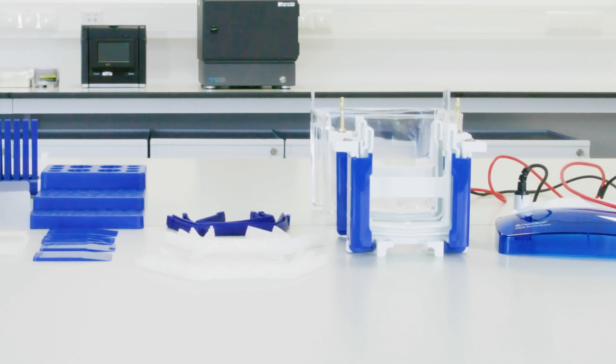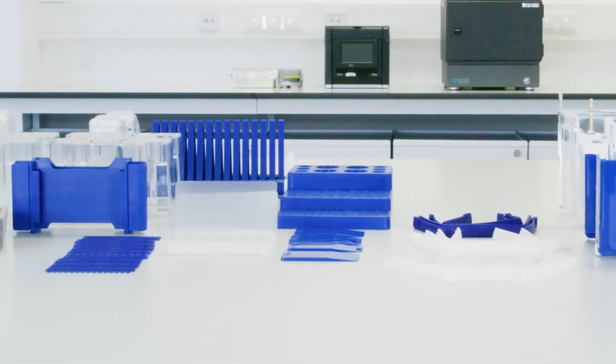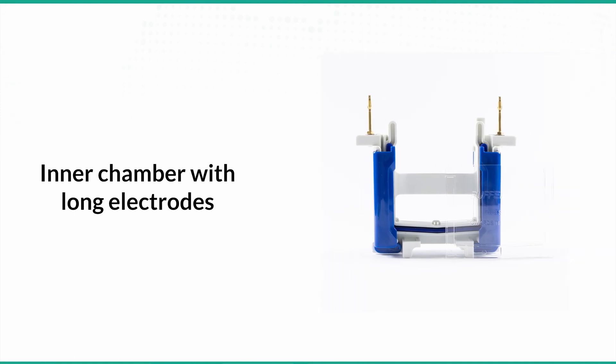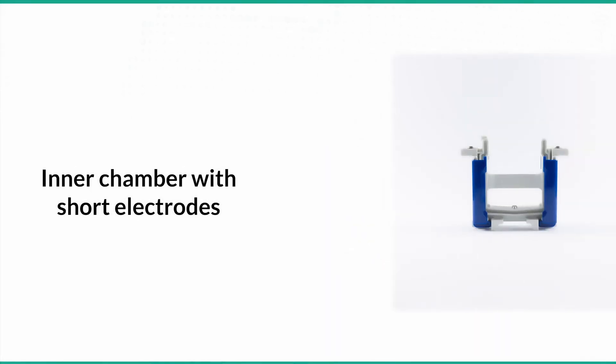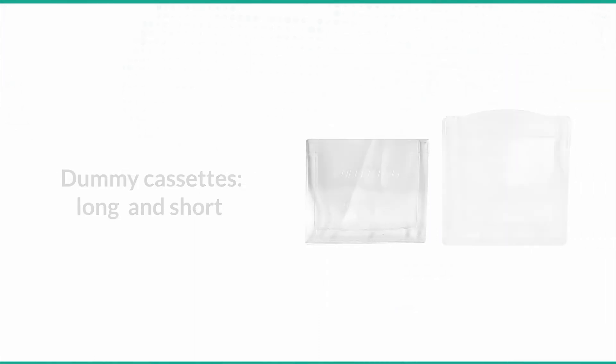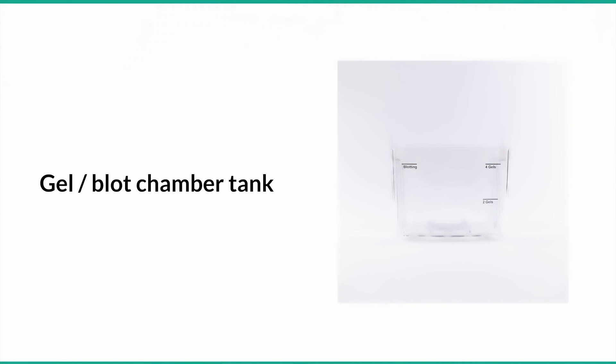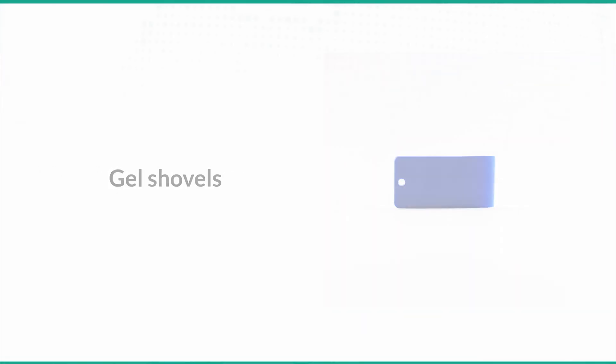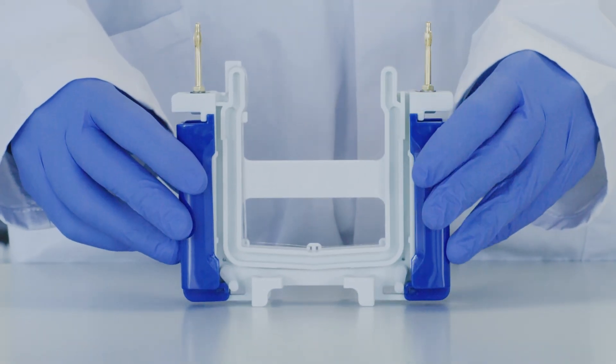Unpackage all components for GIL electrophoresis from the boxes and plastic bags. This includes an inner chamber with long electrodes, an inner chamber with short electrodes, three kinds of sealing strips, a dummy cassette for two different GIL sizes, a buffer chamber tank, a lid with power connectors, and GIL shovels. Start by selecting the inner electrophoresis chamber with long electrodes.